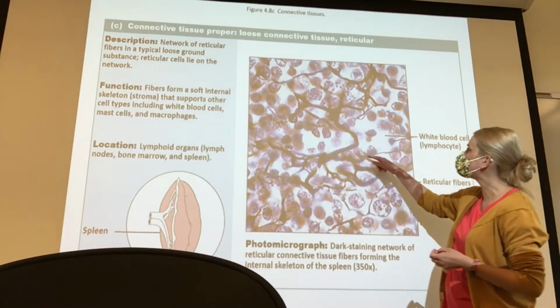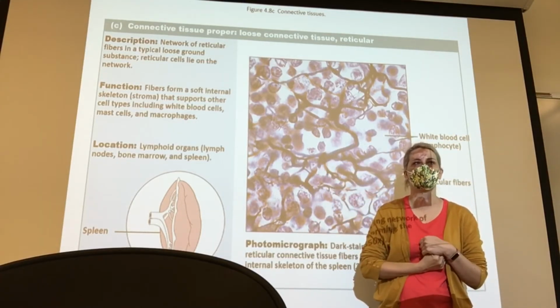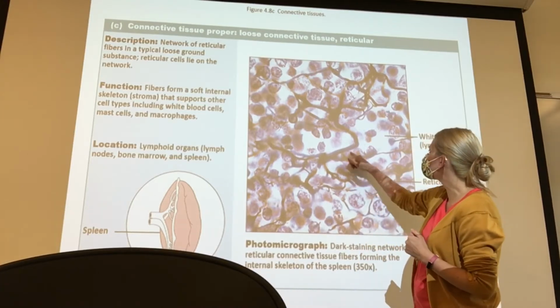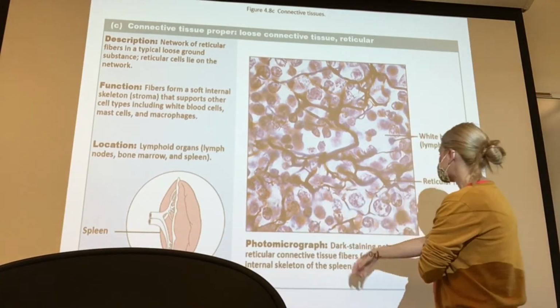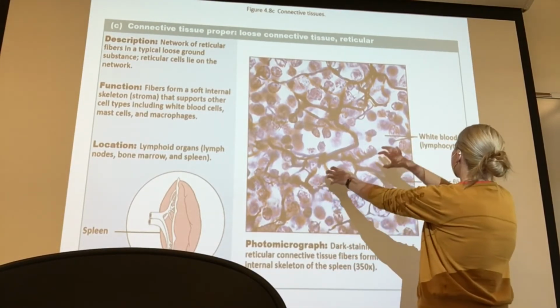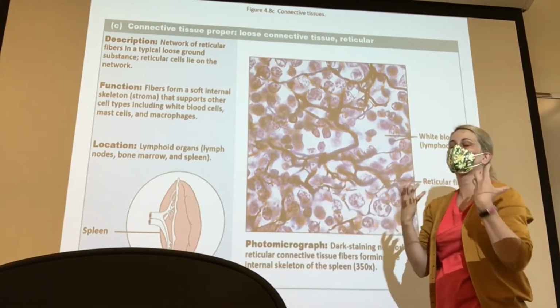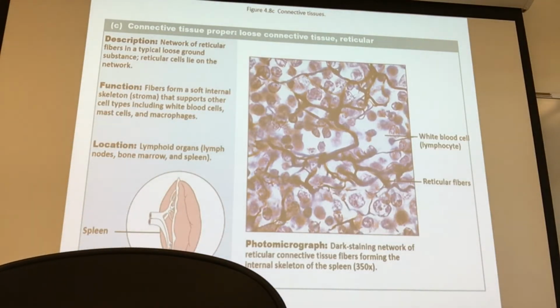You'll see that it looks like a cherry blossom tree. I always feel like it looks like a cherry blossom tree when the blossoms are out. It has these very thick fibers, like the trunks of the tree. And then all of these teeny tiny cells look like the leaves of the tree to me, okay? So they are less structured, relatively looser, for sure.